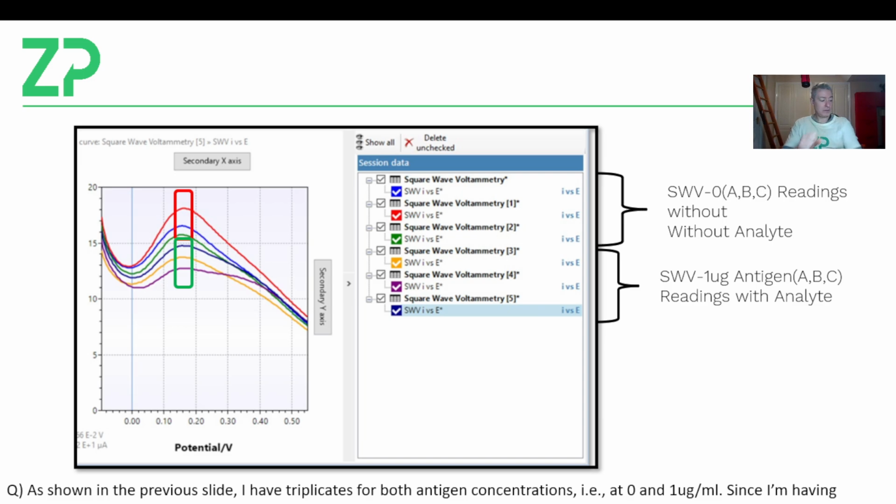I think it starts off with the underlying electrodes that you're using are probably not as reproducible as you would like. This is the biggest problem in the biosensor development world, that people think that the screen printed electrodes they're getting are reproducible. I had a gentleman the other day who is not going to buy screen printed electrodes from us because he can find them cheaper elsewhere. That's a real problem because, in the R&D phase, he's going to come into the problem that he doesn't actually have a fundamentally reproducible screen printed electrode. That is a big problem with people who are developing biosensors.